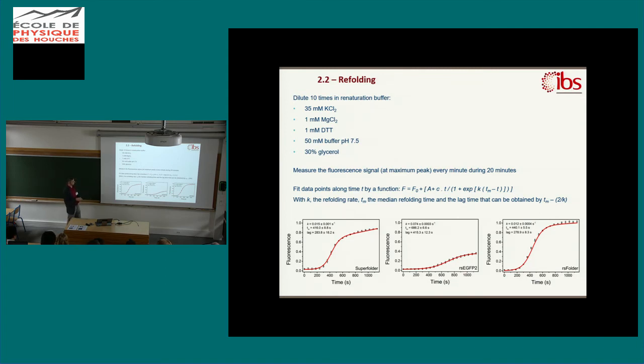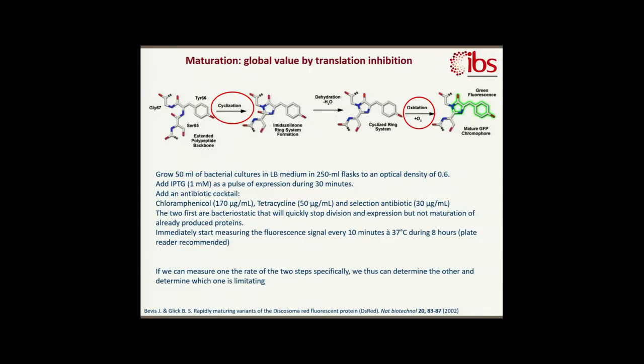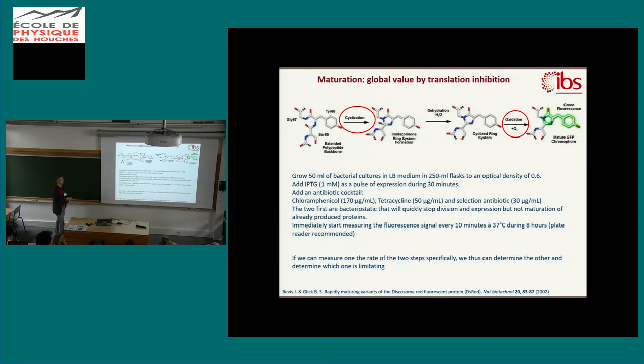So with this formula, you can fit all these parameters and have the lag time and the rate of refolding. So that's exactly what you want, I guess, when you want to know the folding of your fluorescent protein. Maturation of the chromophore, it can be. So that's the maturation process, and whatever the order of oxidation and dehydration that is still debated, I think there are at least two limiting steps in maturation of the chromophore. That's the cyclization process, that is the first step, and the oxidation, which is the second one.